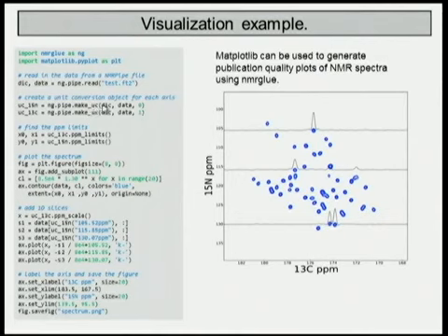To do this, we can make a unit conversion object so that we can index our arrays by some more natural units that we see in NMR. The strip plots here are just generated at 105 ppm and 115. These are just units that we use in NMR.